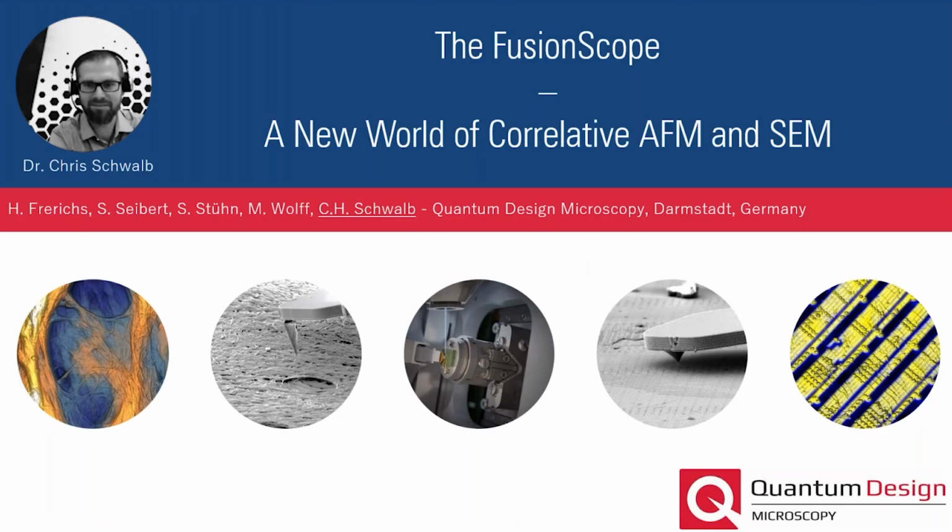Also from my side, a very warm welcome. I now want to talk a little bit about the FusionScope and tell you why we believe that the FusionScope really opens a whole new world of correlative AFM and SEM microscopy.